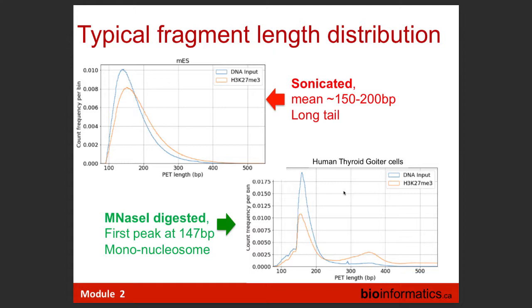If you get something less than that, there are still many high-quality ChIP-seq libraries with that low mappability, because you've got salmon sperm, you've got other material that's been brought down in your IP. But a good quality library should be 75-80% or above, right? Even now we have much higher than that, in the 90s. Of course, if the cutoff is 50% and I have 49.9, and you go to your PI, yes, we still use it. Of course, it's a discretion. Even 30% of the reads can be useful if you really understand what happens and those alignments are not accidental. There is no such hard point. Of course, when you try to publish it, you will need to explain why your mappability is low.